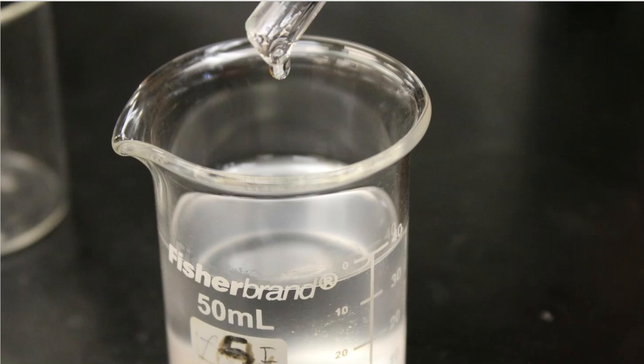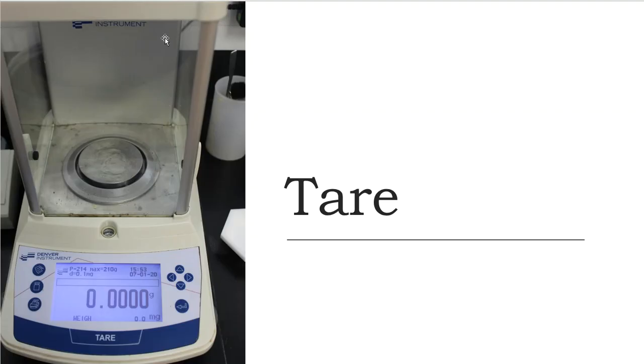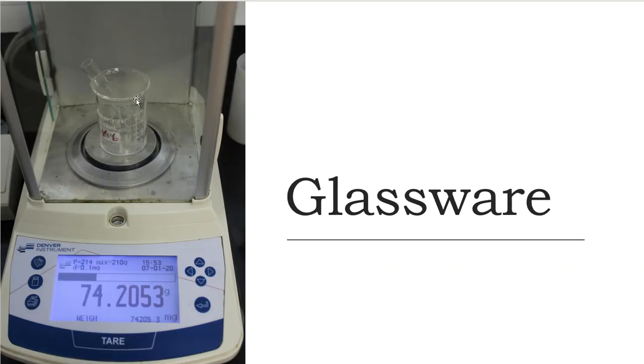All right, so at this point, what I decided was this is how much I have left over. I probably don't want to keep cranking the heat on this and run the chance of scorching it. So I decided on another option. I went back to my balance and tared it out, 0.0000. Then I took some glassware, a beaker with a test tube, and I massed the beaker and the test tube. That came out to be 74.2053, just in case I needed it.